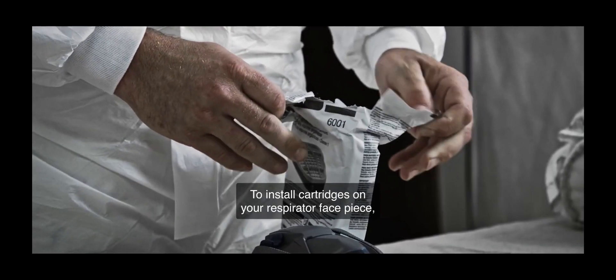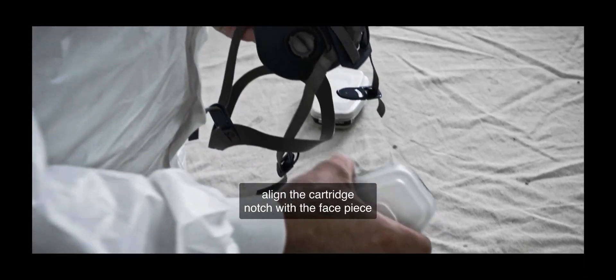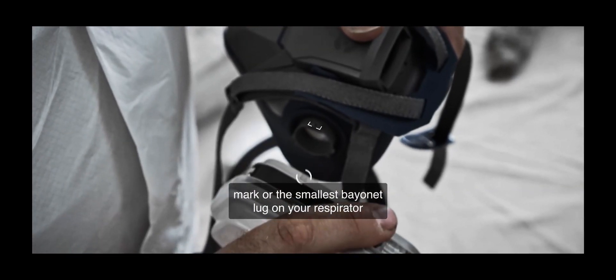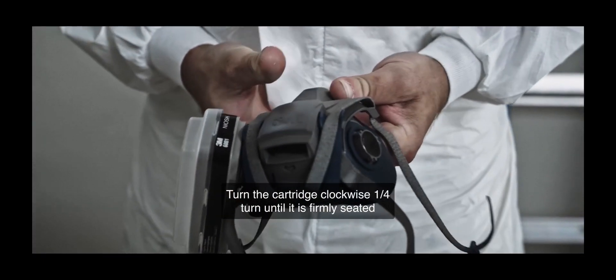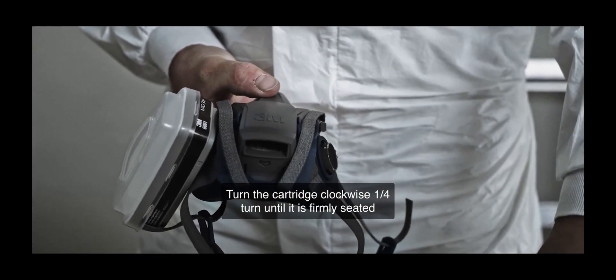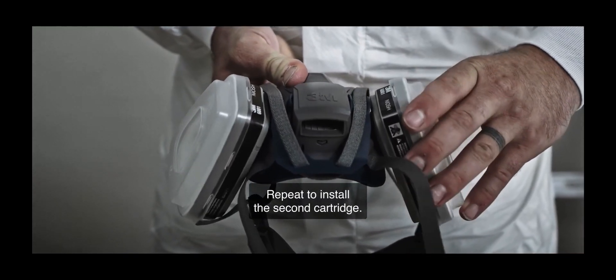To install cartridges on your respirator facepiece, align the cartridge notch with the facepiece mark or the smallest bayonet lug on your respirator and push together. Turn the cartridge clockwise one-quarter turn until it is firmly seated and cannot be turned any further. Repeat to install the second cartridge.